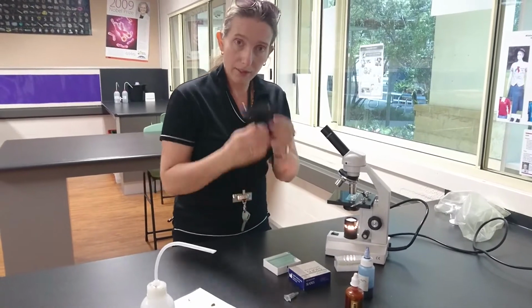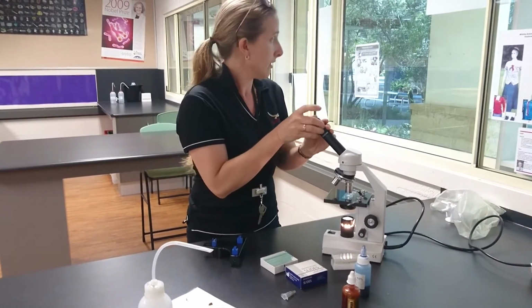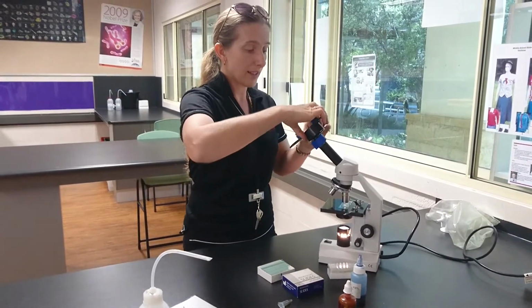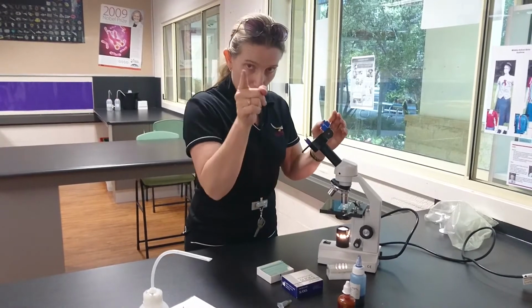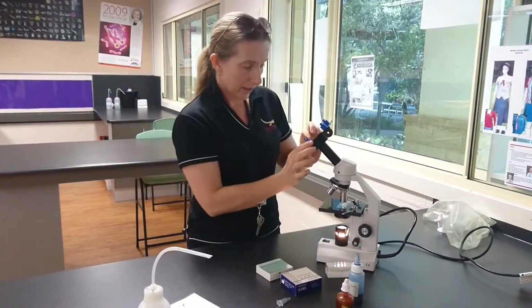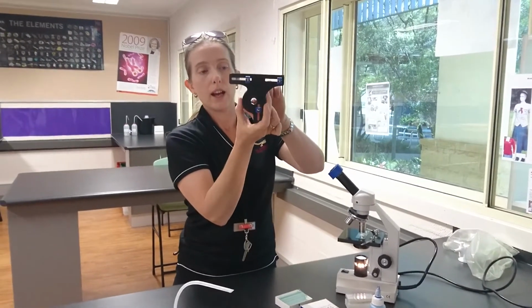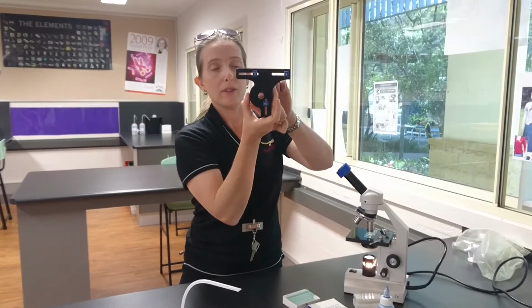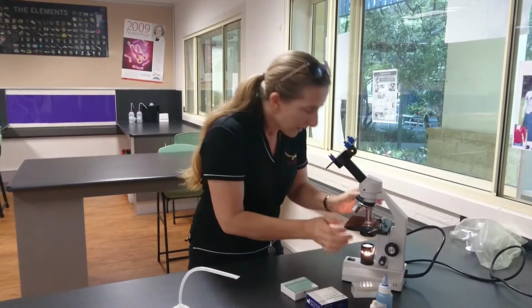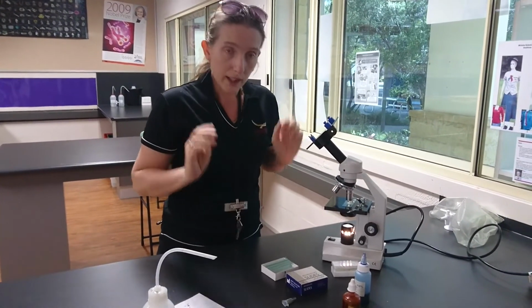And most of you will have these things to attach to your microscopes like this, so that you can use your mobile phones as a camera. Now my mobile phone is being used right now to actually video this, but what you have to do is you put your mobile phone in there. Make sure the eye for the video feed is there. You can see through it. Stick it on there. You focus it, and then take a photo. And that's how you prepare a slide.